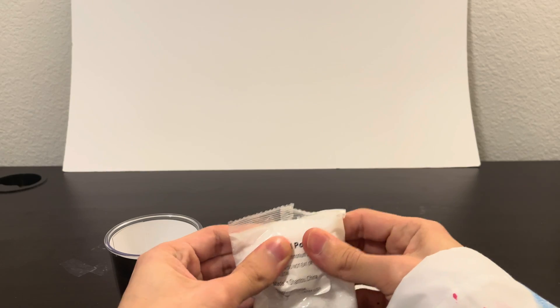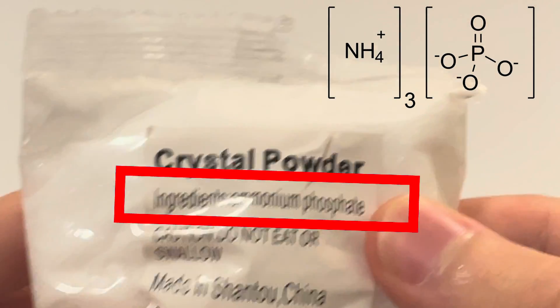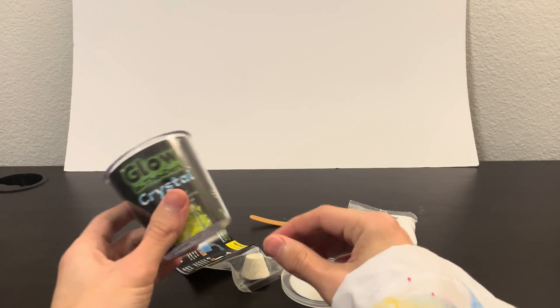Here's our crystal powder. Looks like the powder is going to be ammonium phosphate. And one more — got a label on this, let's see what this is.